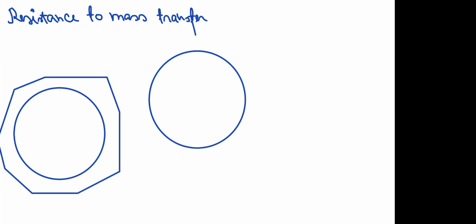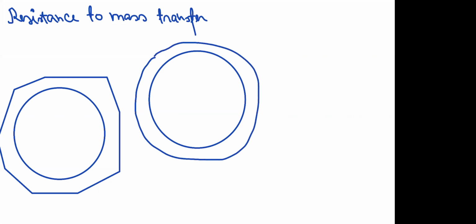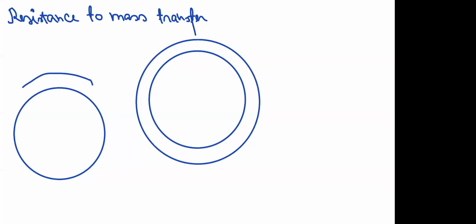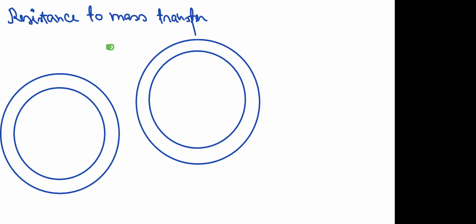So in case of gas chromatography, these are immobilized liquids. In case of liquid chromatography, these are either layers of water, for example, in case of normal phase and HILIC chromatography, or they are just liquid-like acting layers, for example, in case of reversed phase chromatography. So let's say we have these layers here, on top of the stationary phase carriers, for both particles. And now we also have our molecule that is traveling through the column.